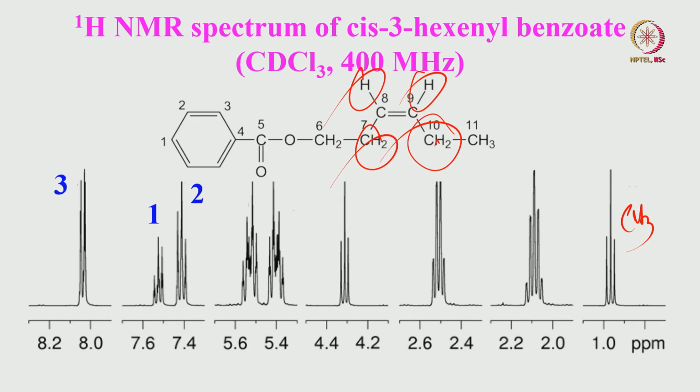And if you come to this one, I can fairly interpret it in a simpler way, because CH2 is attached to oxygen, it comes downfield, and that is the only proton which can appear like a triplet apart from CH3. Look at it, this is coupled only to this, and there is a breakage here, because these phenyl groups are not coupled to this, far away. So obviously there must be one more triplet. This is proton 6, because there is only a triplet.